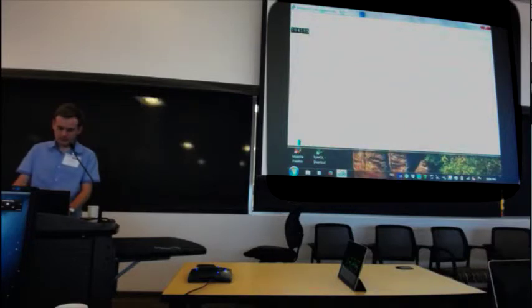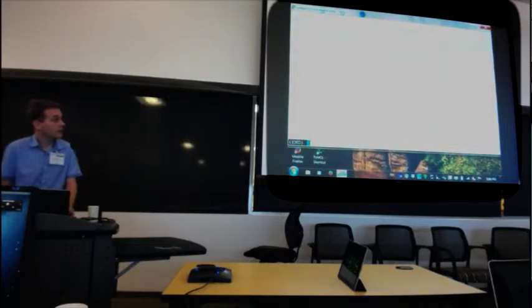Then we need to find. So now the output file looks like that.